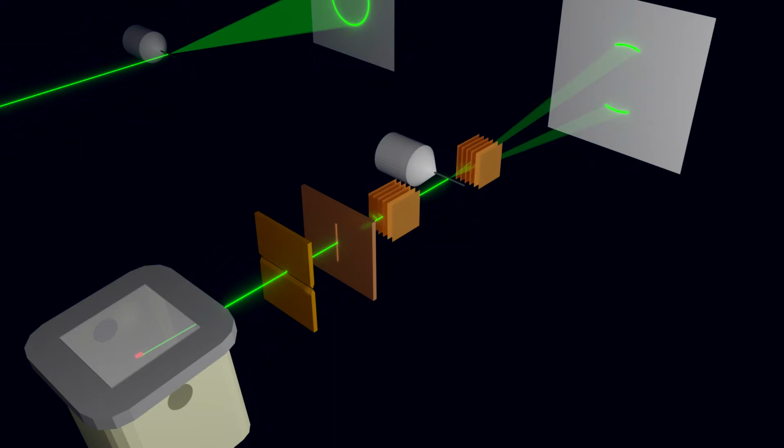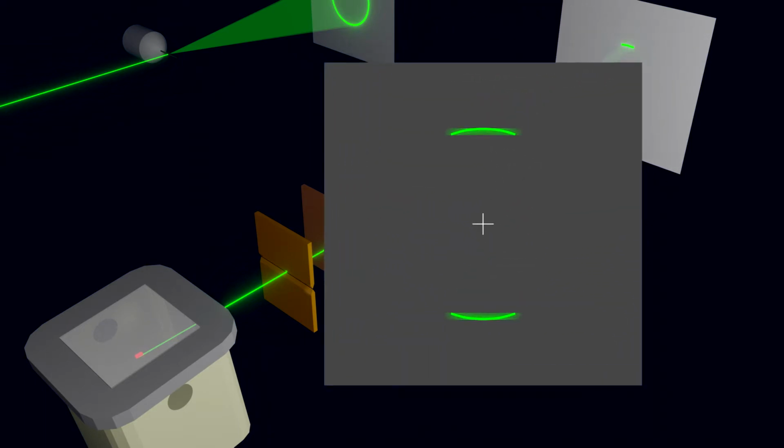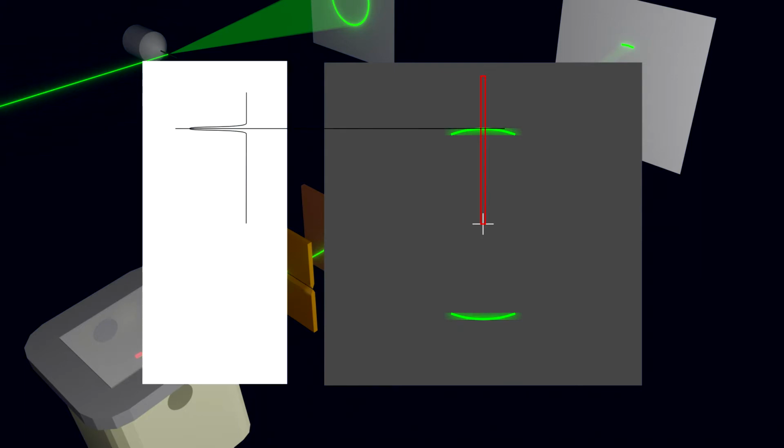We can also strongly reduce the angle of the Soller slits, both of them, to block divergent primary rays and curved diffraction ring segments on the detector. Now only a small segment of a centered diffraction ring reaches the detector. We can also insert a pinhole aperture with an opening of the beam diameter very close to the sample to further block divergent and scattered rays. As a last step, we reduce the width of the detector to a very small value to really only measure the center portion of the segment and none of the curvature. As a result, we should obtain an almost perfectly symmetric peak profile.